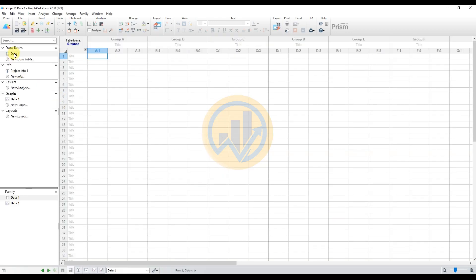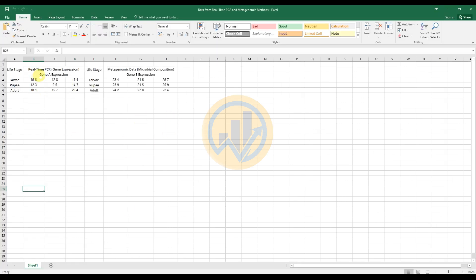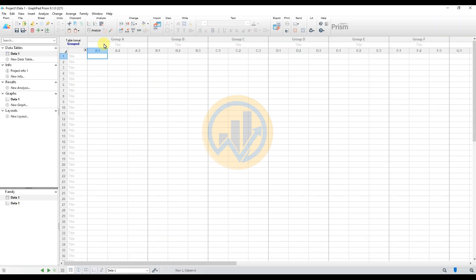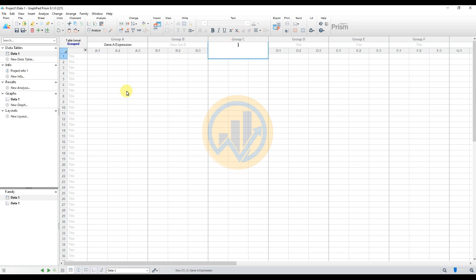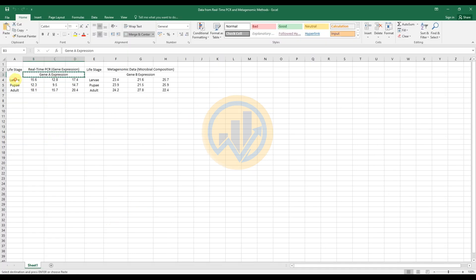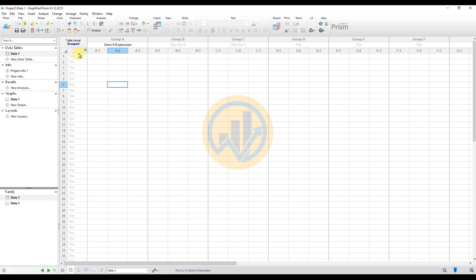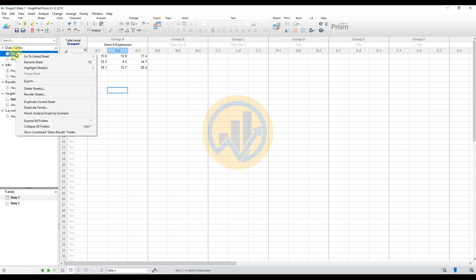The data sheet opens. Enter the data in the GraphPad Prism worksheet. Open Excel, copy the gene expression data for Gene A, and paste it into the Group A title column. Then paste the data values. This is for the Gene A expression data. Change to data sheet one, right-click and rename the sheet, entering the name 'Gene A'.